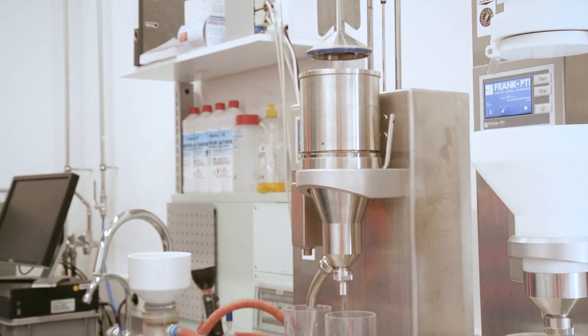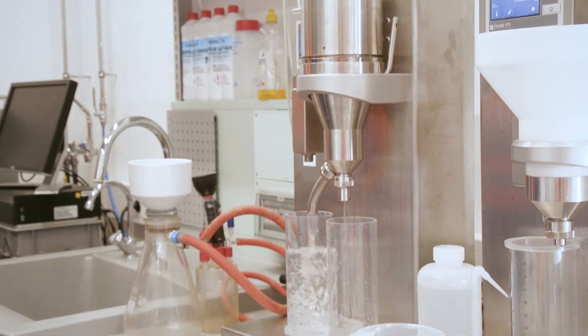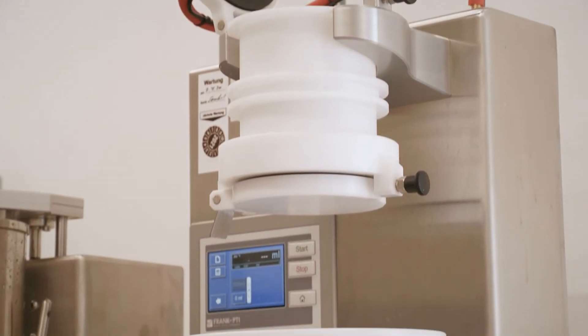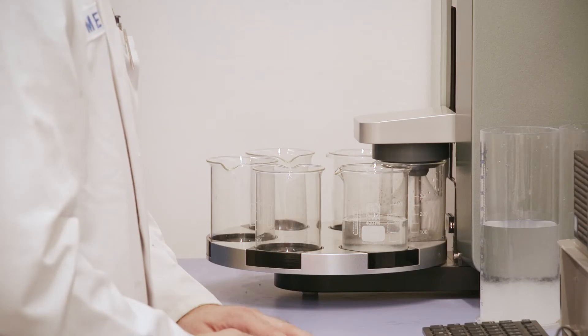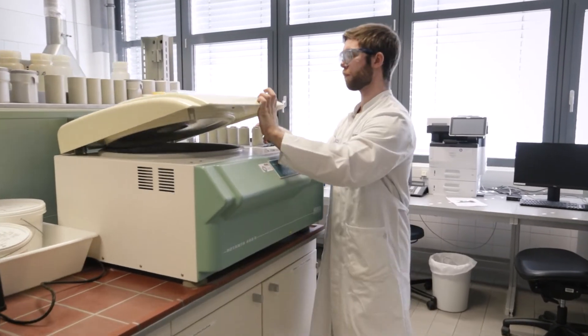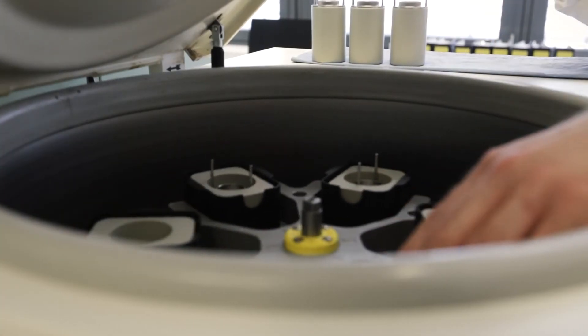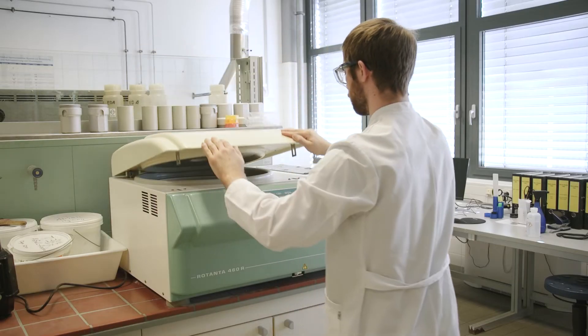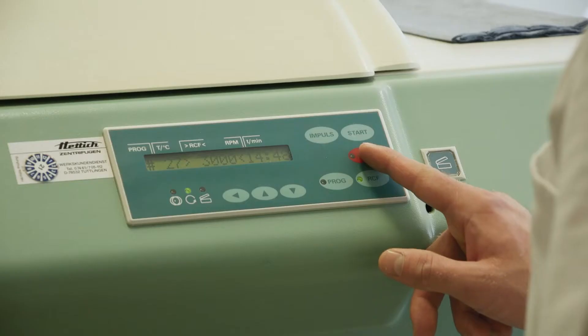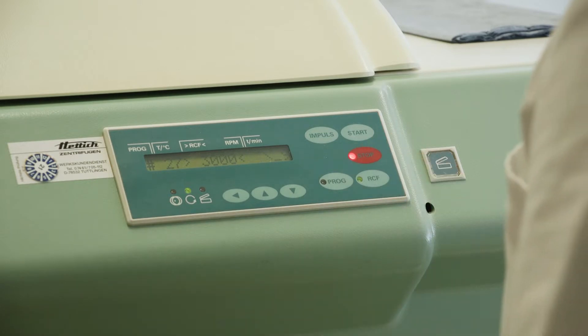The drainage resistance is determined according to Schoper-Riegler or Canadian Standard Freeness if required. We also examine the fiber morphological properties and measure the water retention value as part of our standard evaluation. The water retention value provides information about the water stored in the fiber structure and thus the swelling capacity of a fiber.